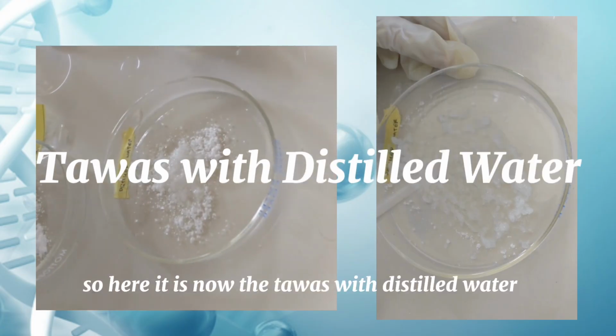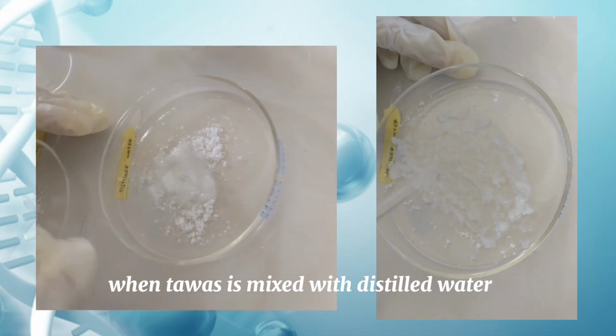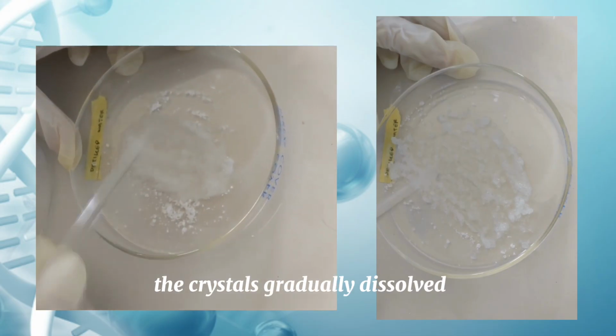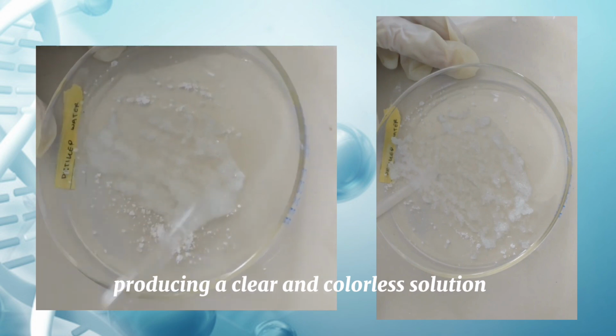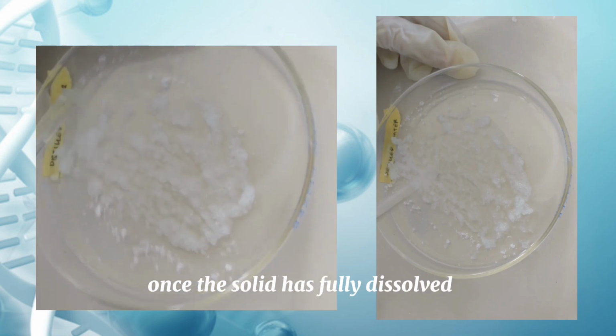So here it is now, the tawas with distilled water. When tawas is mixed with distilled water, the crystals gradually dissolve, producing a clear and colorless solution once the solid has fully dissolved.